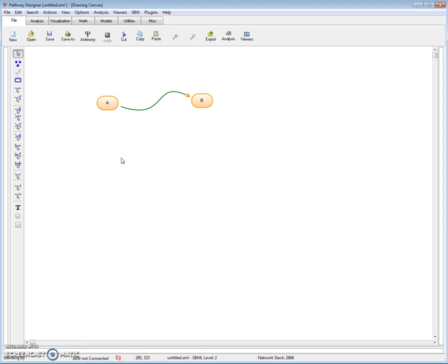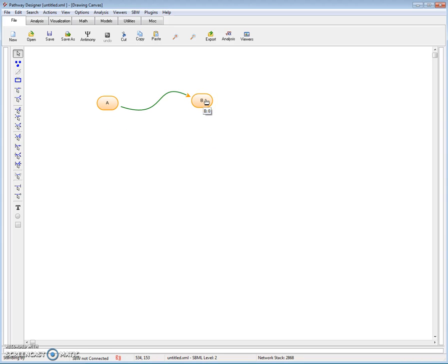Now we're actually ready to simulate. Let me just confirm that things are okay. If I hover over A, you see it's got a concentration of 10. Hover over B, it's got a concentration of 0. And the reaction itself has got a mass action with a rate constant of 0.15.